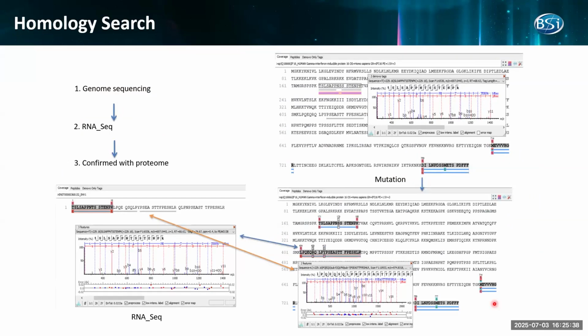And here is one example. For example, there is a data set, and you take those, and you find a sequence. You find this is a very good de novo sequence. However, this spectrum cannot match to this sequence. There is a difference: here is S, but here is T. With this algorithm, you will match with this one by converting this S to T, and we believe there is a substitution.